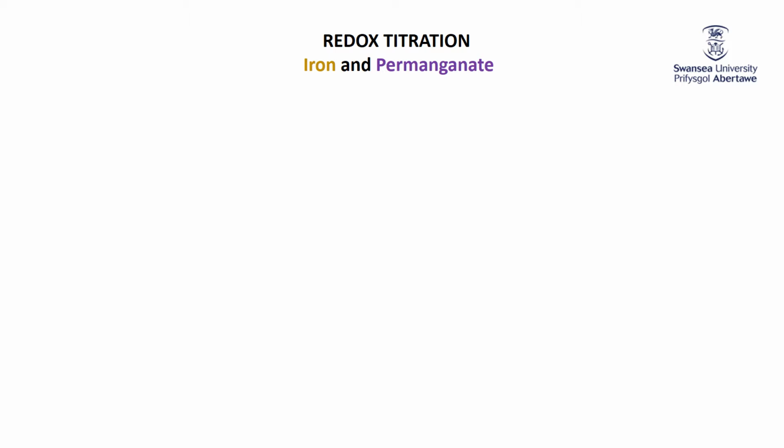Anyway, the 2 experiments: this one here, we're going to talk about redox titration, and then a different one that if you want to, you can ask your teacher for, and that is a harder one on the analysis using spectroscopy of aspirin. Anyway, back to the redox titration.